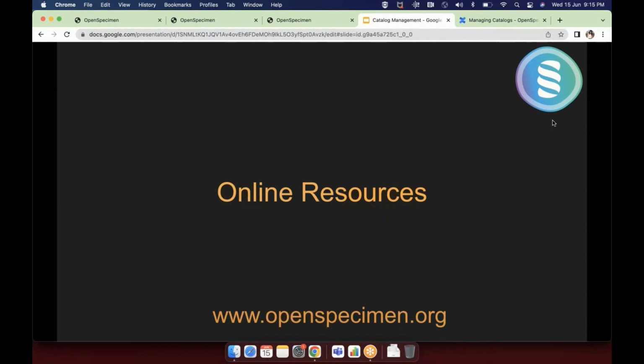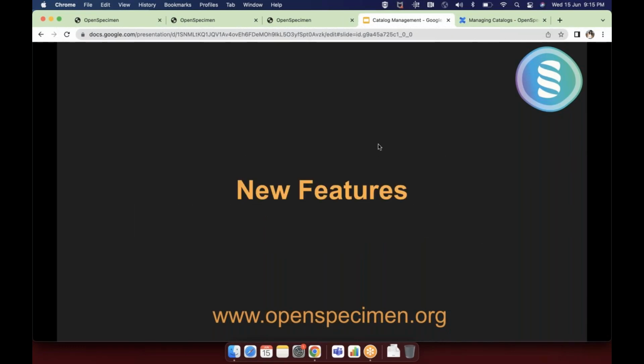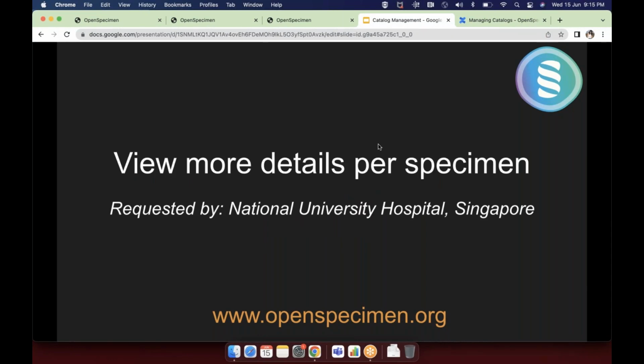It's Richard from Oxford. First question, how much of what you've shown is specific to version 9 and how much predates version 9 of OpenSpecimen? Yeah, sure. So the last few slides I showed, those are the new features. These are part of mostly 8.2 and above.